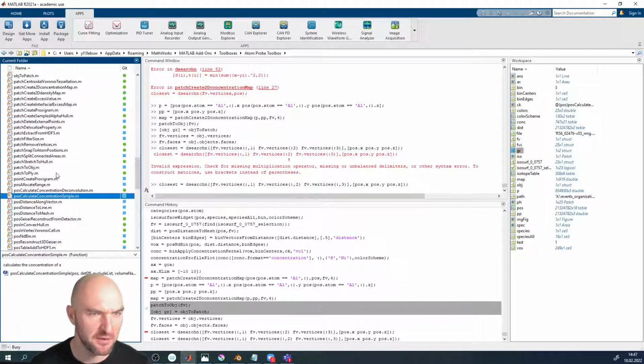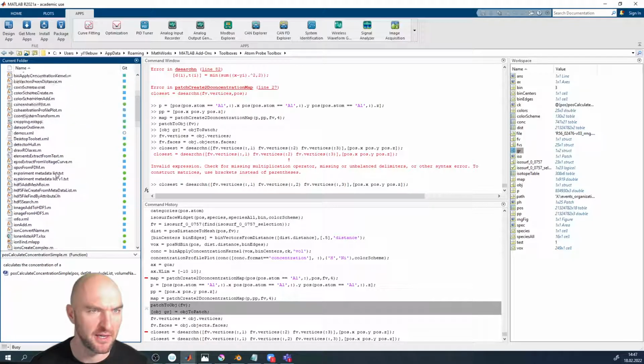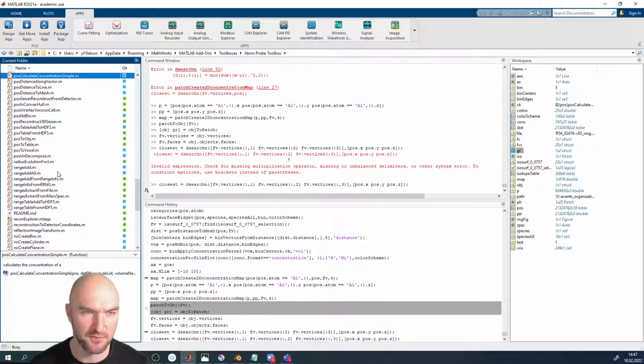I was 100% convinced that we've already migrated that. Maybe I've overlooked that somewhere. By the way, you can also use it pretty easily to split up a data set into individual domains that belong to individual objects.